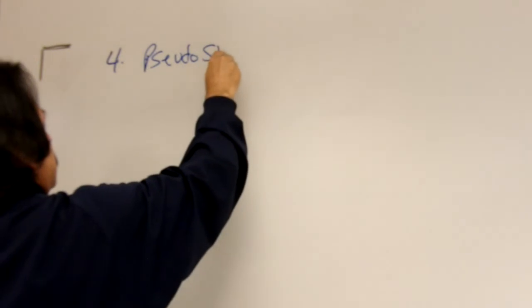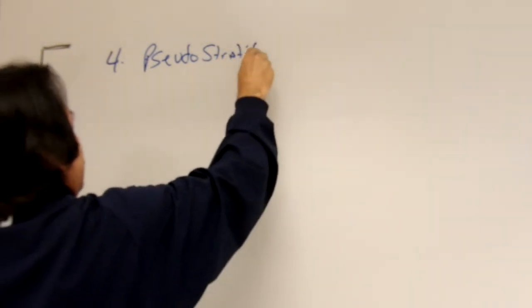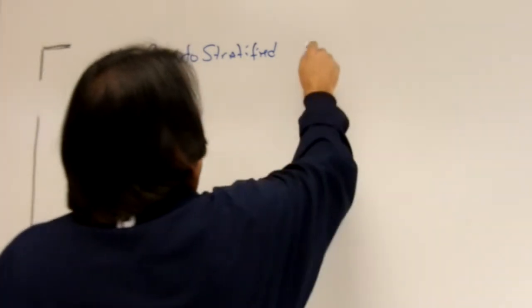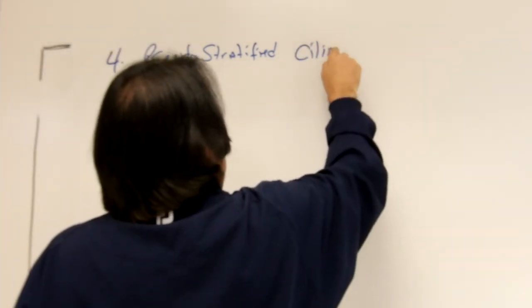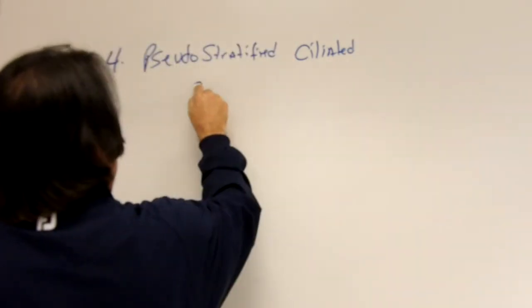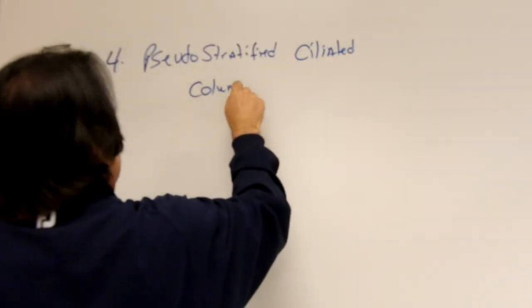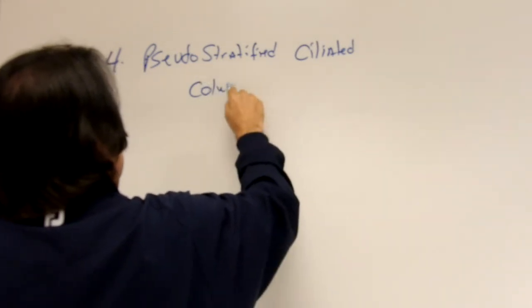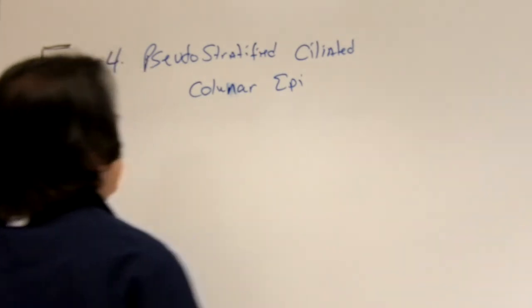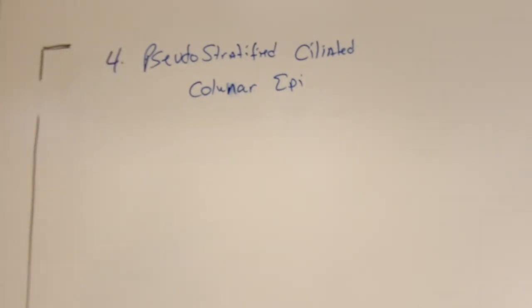Pseudostratified, ciliated, columnar epithelium.